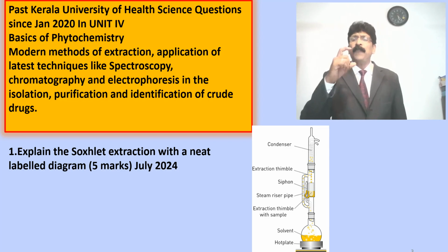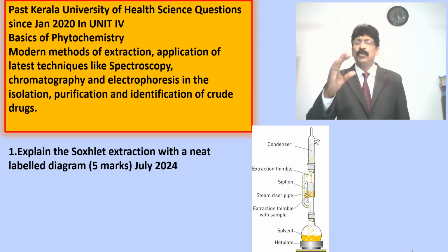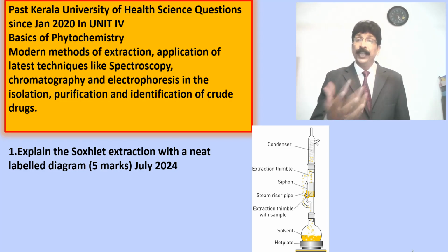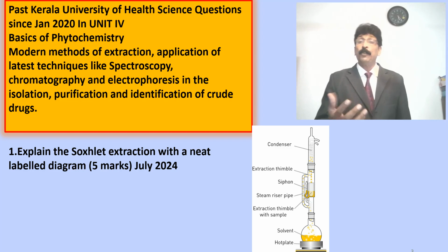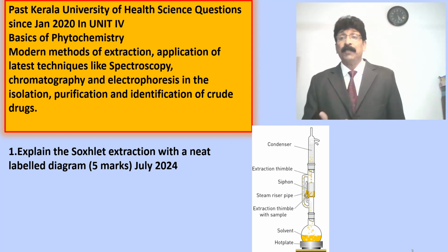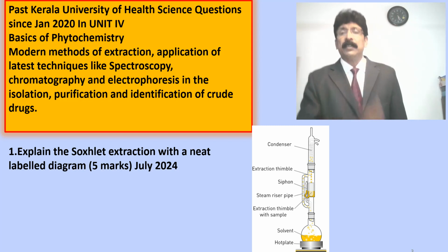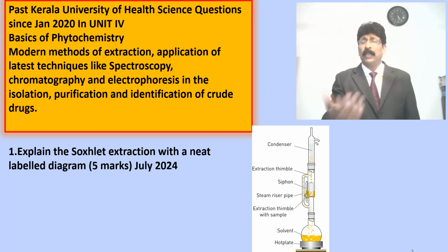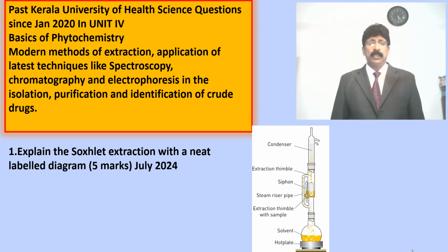It is very important if a student knows it practically by doing it in the lab. Many Soxhlet apparatus are available in our lab, with variations in sizes and capacity, and it will be more helpful if the student does it as an experiment for extraction by hot continuous Soxhlet apparatus. It is also an example of the hot continuous percolation method.